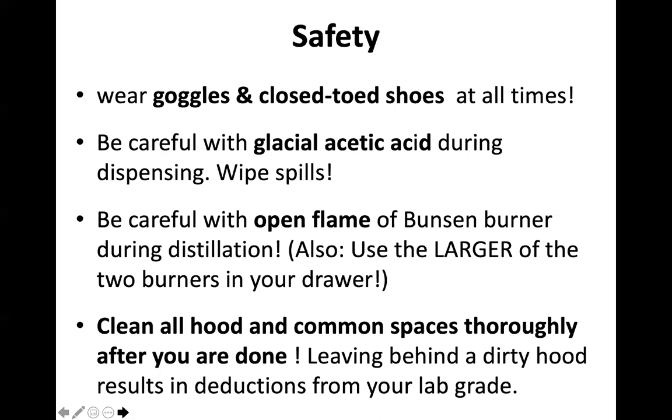If you were to make any spills, please wipe that immediately. Be super careful with the Bunsen burner you're using today during the distillation. Again, I want to repeat, you're using the larger of the two Bunsen burners that you have. So be very careful with the open flame. As always, long hair definitely has to be tied back, and you want to be careful to not burn yourself, and definitely make sure you keep any of the hosing or any things that are flammable out of the way of the Bunsen burner.